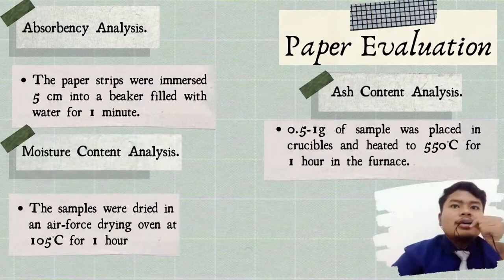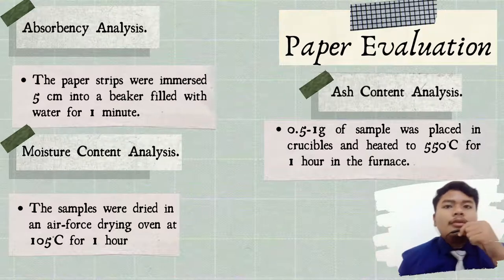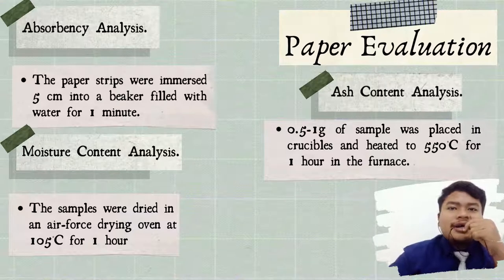Paper evaluation. In order to evaluate the paper in more detail, a sample from a commercial paper bag was used as a standard for comparison. There are 3 steps for paper evaluation. Absorbency analysis. This analysis begins with a sample in the shape of a paper strip with the dimension of 10 cm multiplied by 2.5 cm. Then, the dry paper strip was weighed using the analytical balance and the data obtained was recorded. After that, the paper was immersed 5 cm into a beaker filled with water for 1 minute. The wet paper strip was weighed.